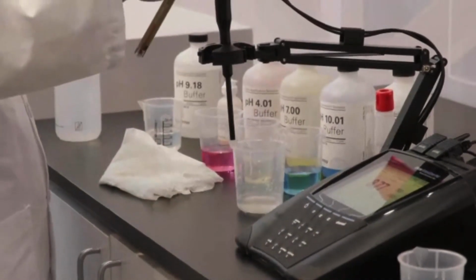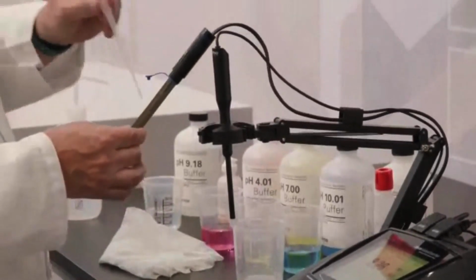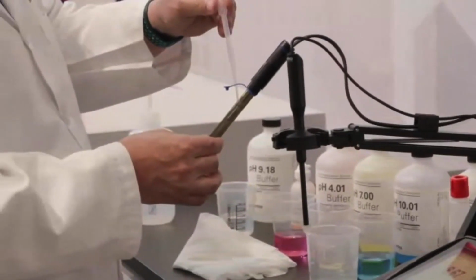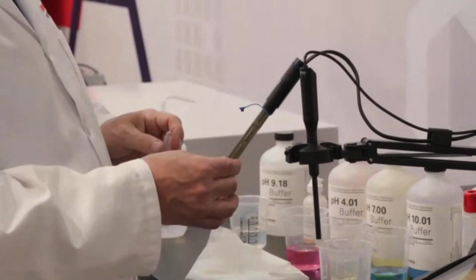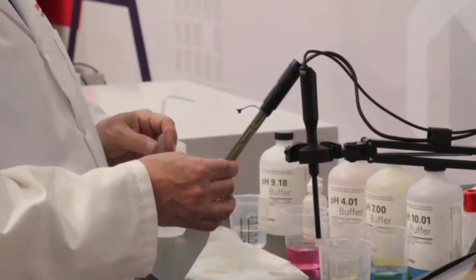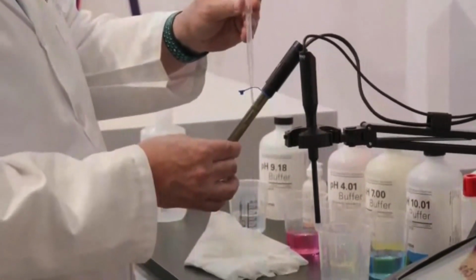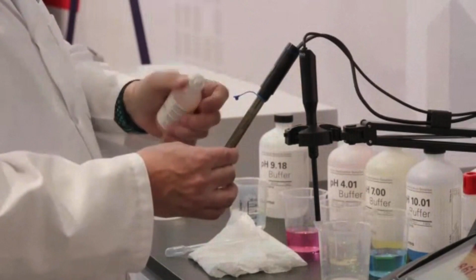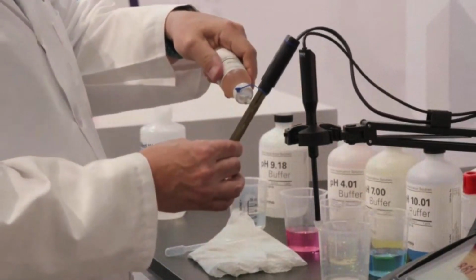We can show them how you would change the fill solution if we want to, although we don't have to do that. So he's got a transfer pipette. We can place that pipette into the fill hole and draw out the old electrolyte fill solution. And then using the squirt bottle, replace that with new electrolyte fill solution. And we can do that once every week or two.